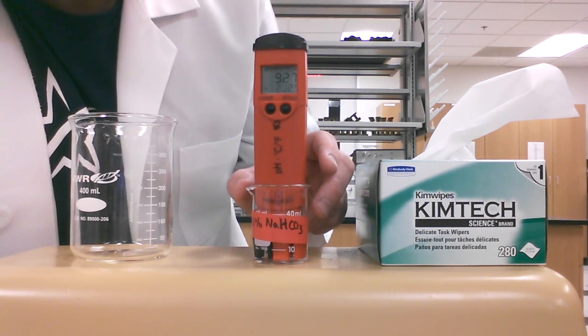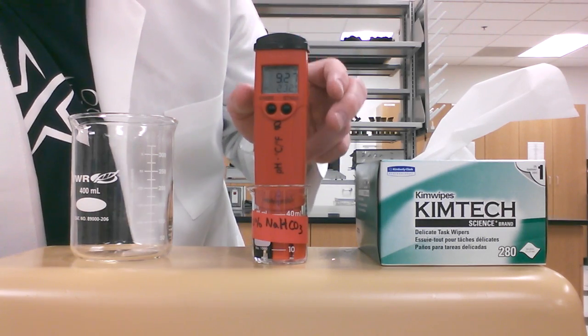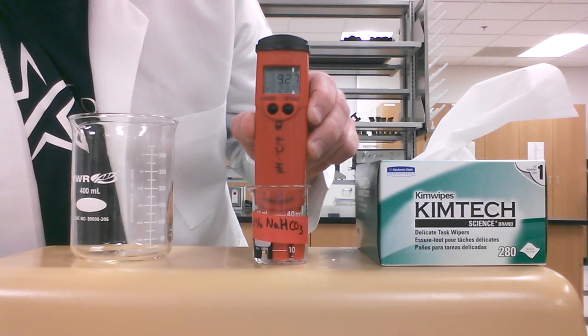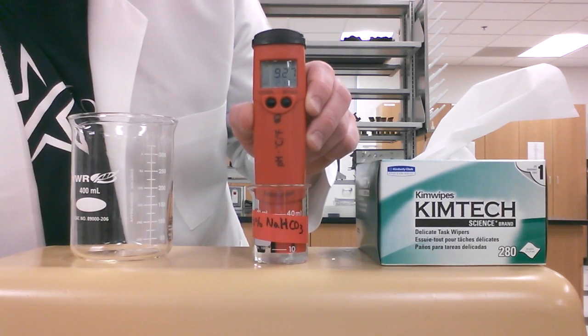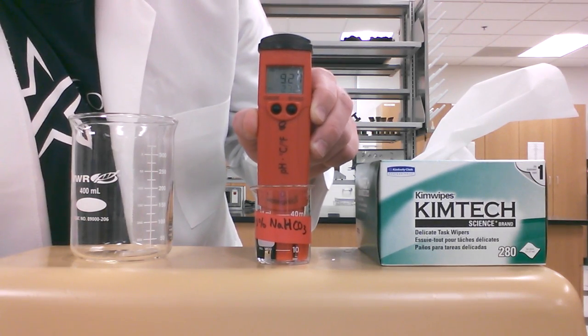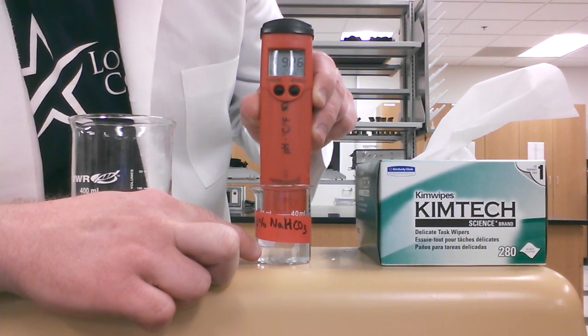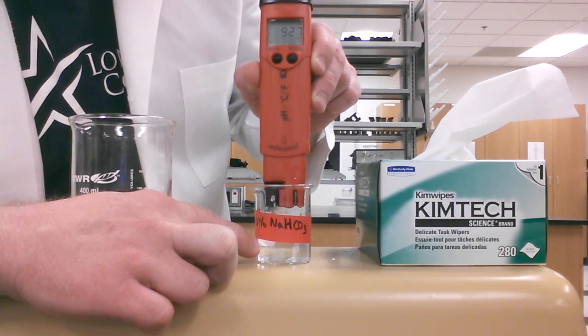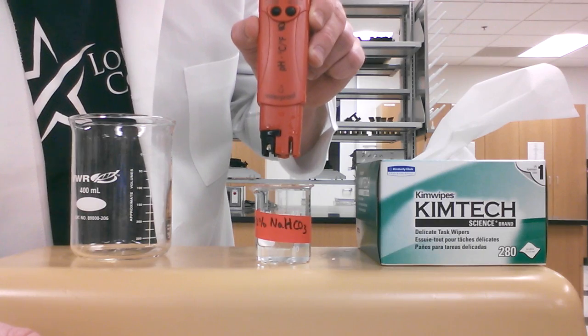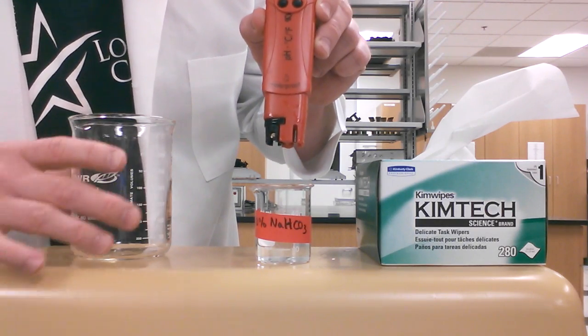Anytime that you're going to change solutions or put the pH meter back onto its cap, we're going to have to rinse the electrode because we don't want to keep any of the things that are inside this solution. We don't want any of that stuff to be stuck on the electrode because that's going to wear it down and make us not able to use it in the future.